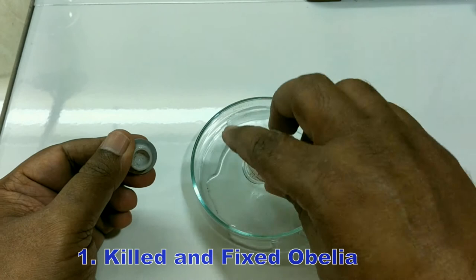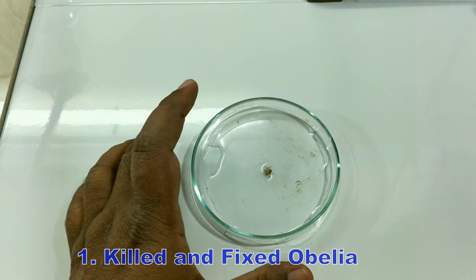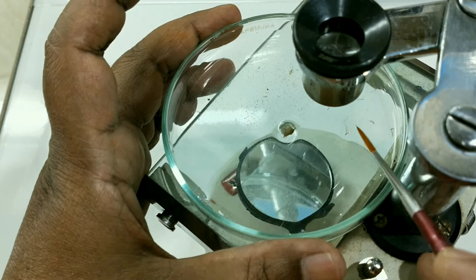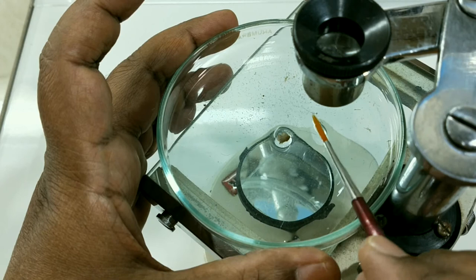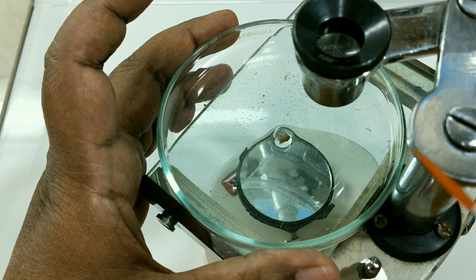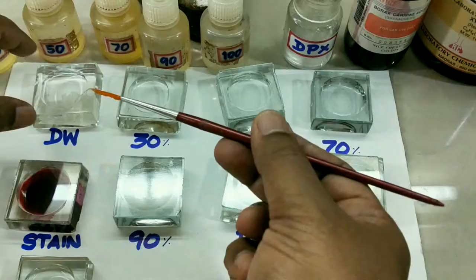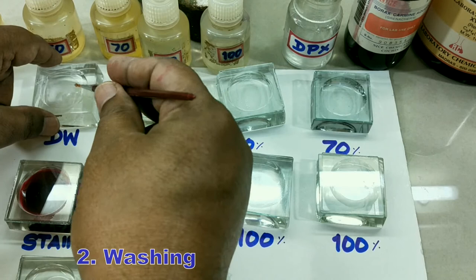Today we shall do obelia mounting. Take the obelia pre-fixed specimen and pour it into the Petri dish. Observe under the dissection microscope. Using a brush or pointed forceps, select a specimen which is complete — meaning without any damage. Transfer it into the distilled water embryo cup.